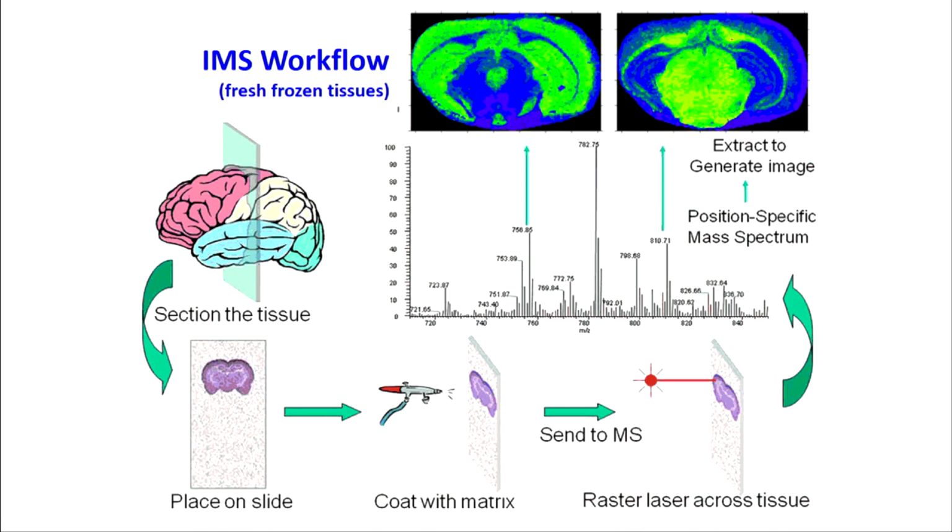First is the resolution, and the second is the accuracy. If you want to go to a single cell, you're going to lose resolution. So this is where we're trying to improve the methods right now, how you can go down to 3 microns and still have good resolution and accuracy for those molecules.